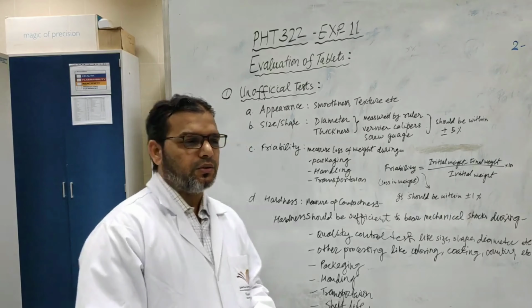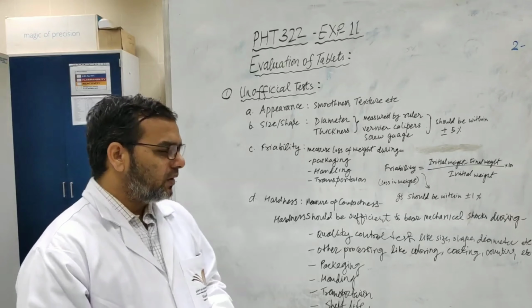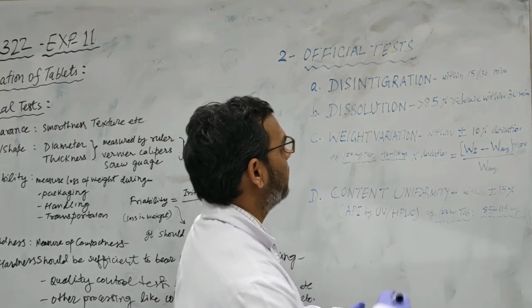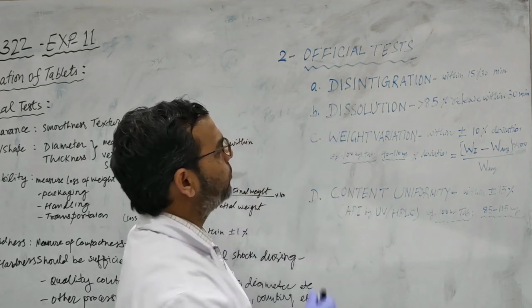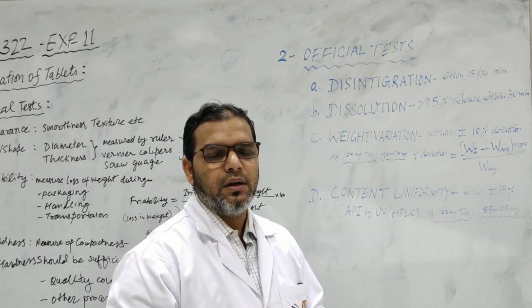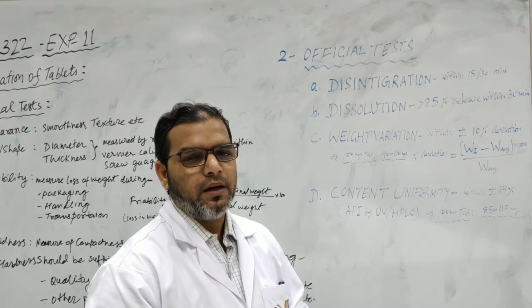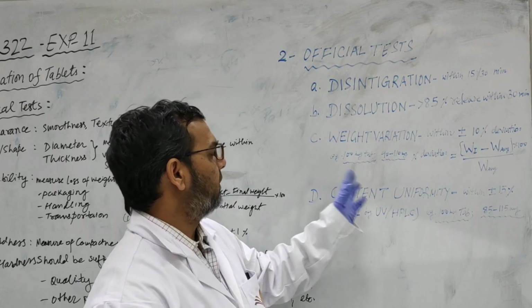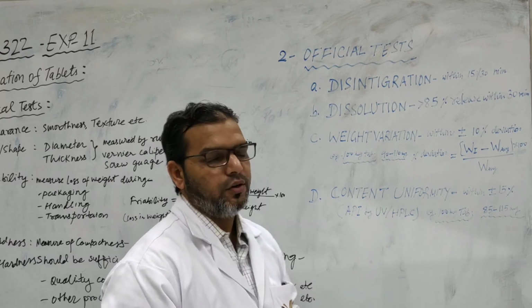Okay, so these are all kinds of unofficial tests. So we have four very common official tests: disintegration, dissolution, weight variation, and content uniformity.